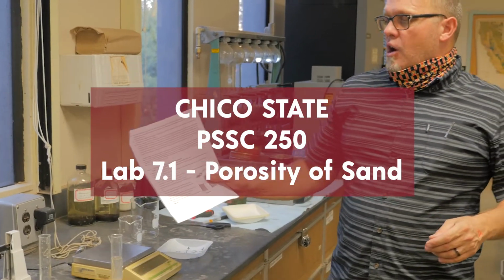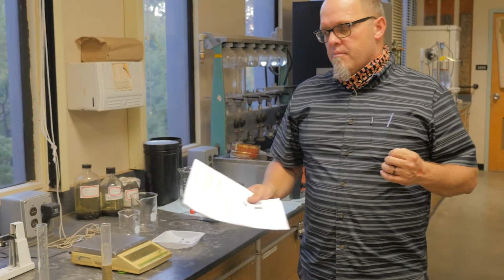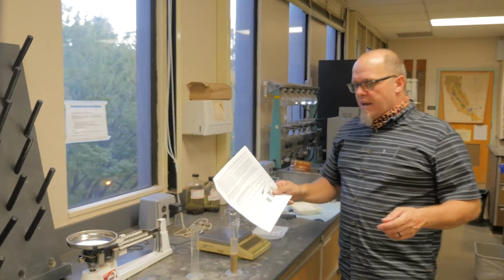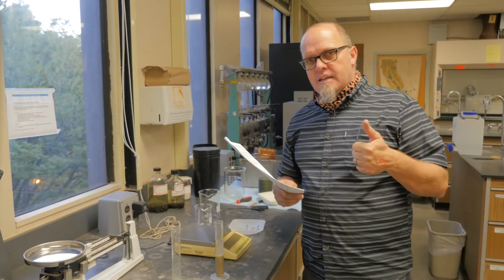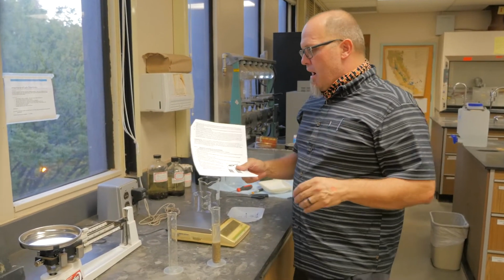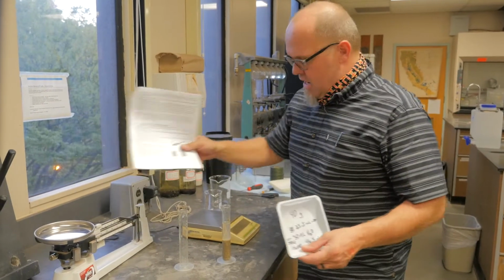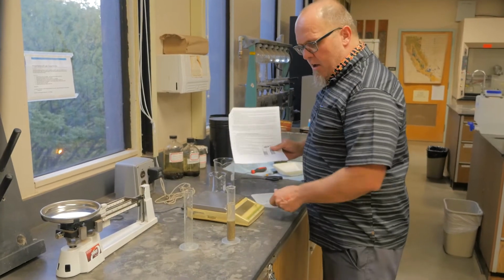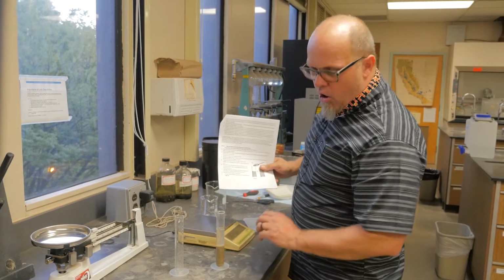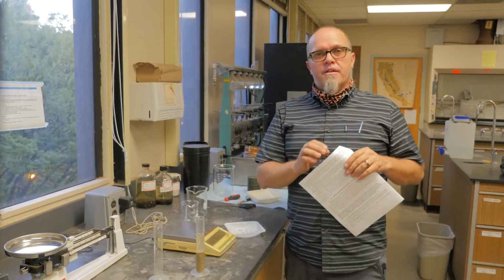So here we are, doing such an interesting and fundamental measurement that we can do with very basic equipment. Right now we're trying to figure out both the particle density and the bulk density of loose sand. We could do that using a scale or a balance, something to measure mass, and a couple of graduated cylinders to measure the volume of both water and solids.